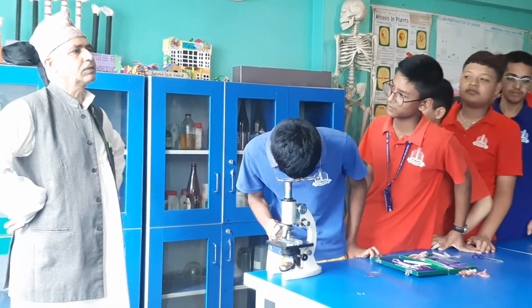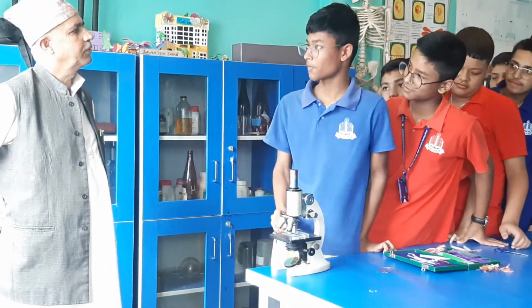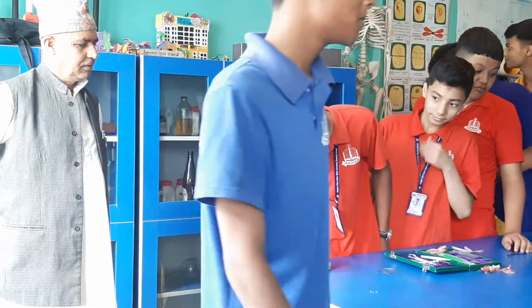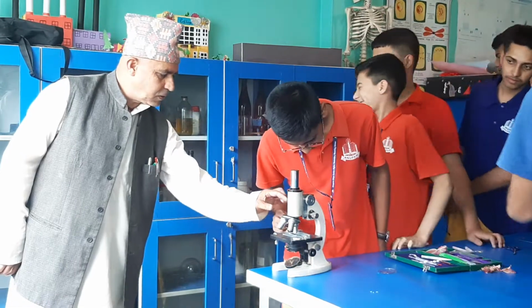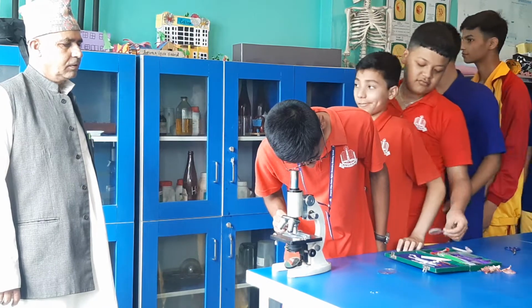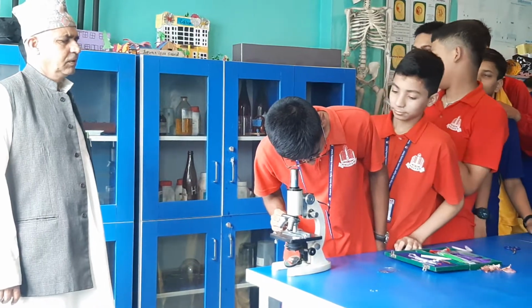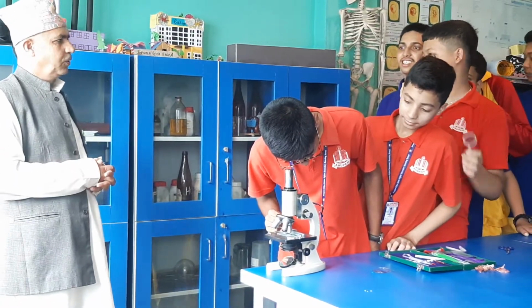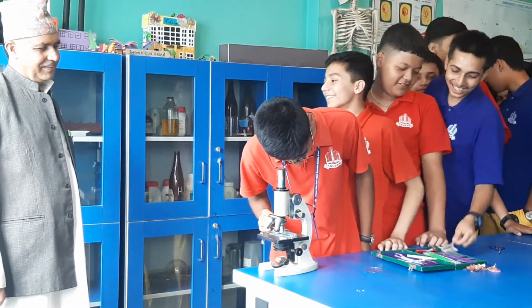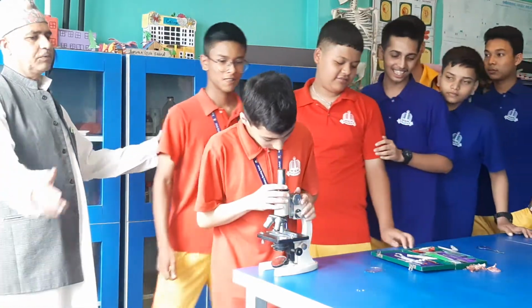You must be able to adjust as well, right? Okay, Sambhav? I recognize him. Very difficult this twin, huh? Okay, viewers, sit check. And Babu, here is the part to move forward and backward. See what you see. Yeah, check. But this is not possible to see all this. For that, we need more powerful microscope. Oh, you are going to use that. That's a good idea. If not seen, then tell me. See some small box like structure. Okay, Ashwin?